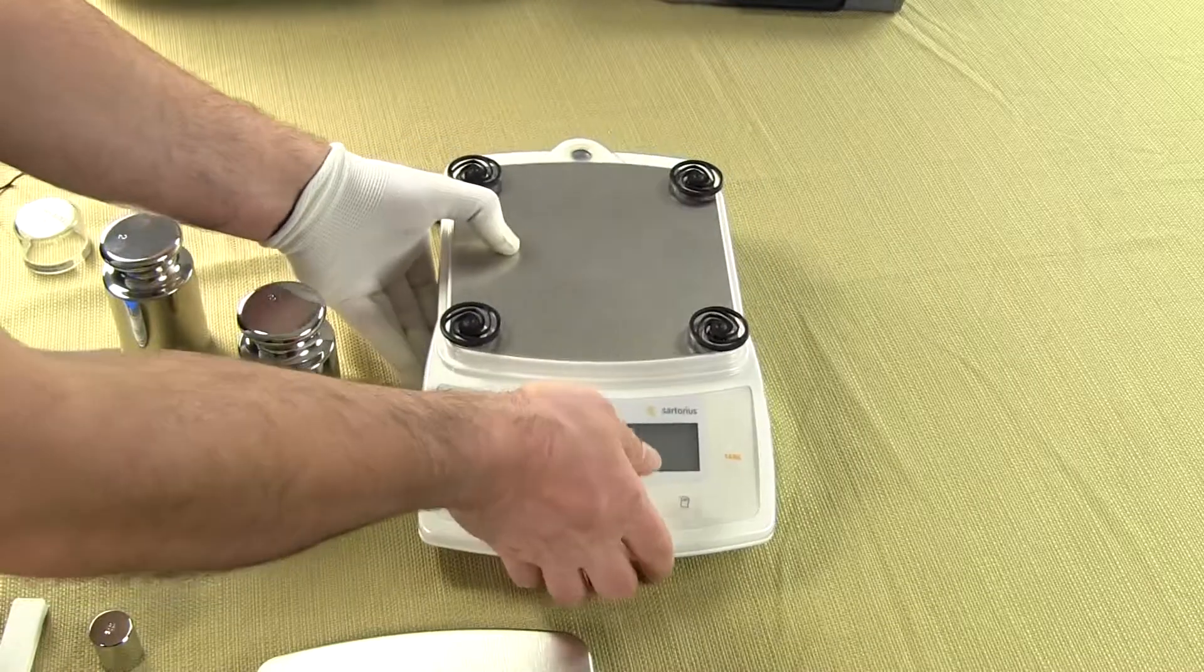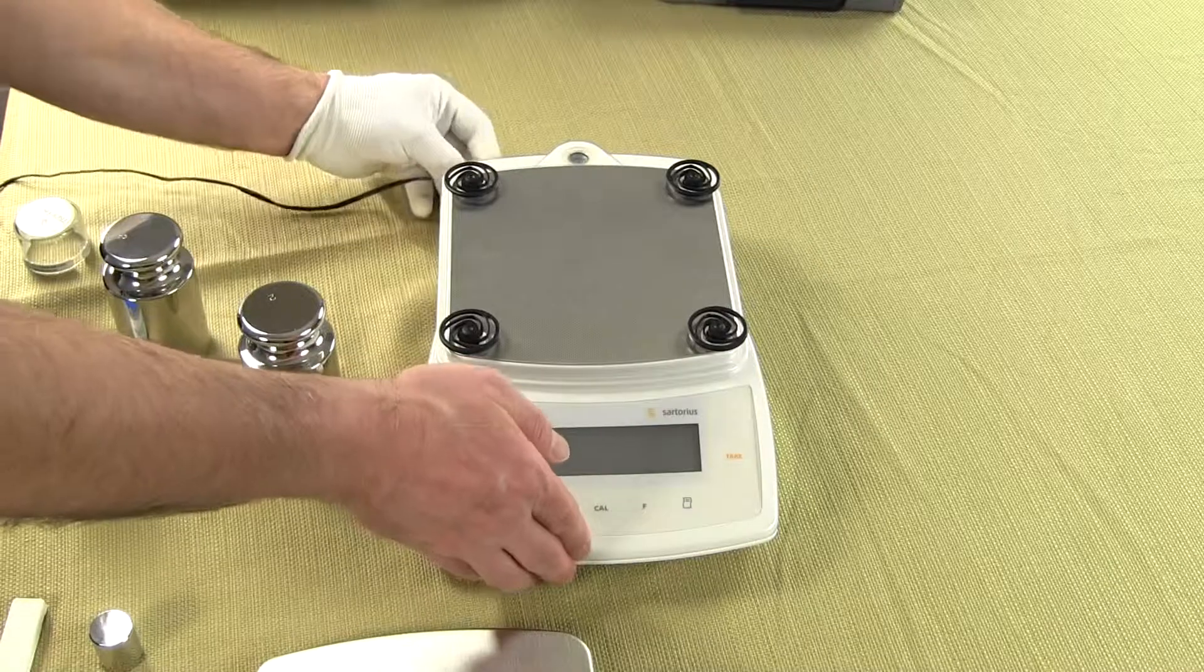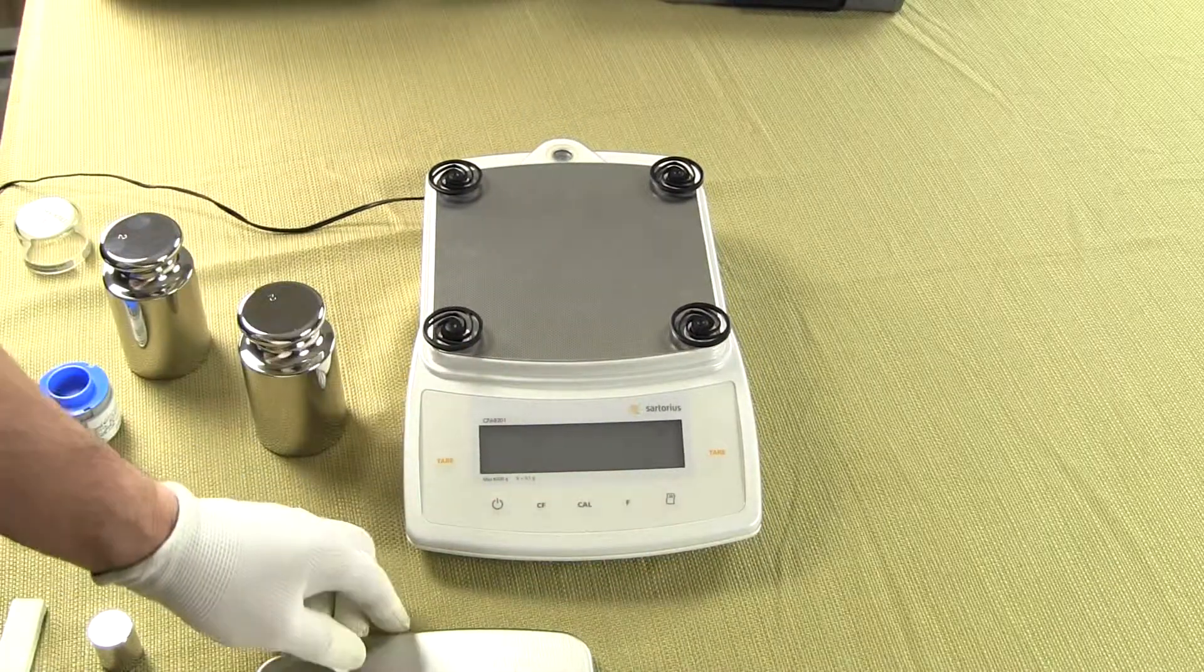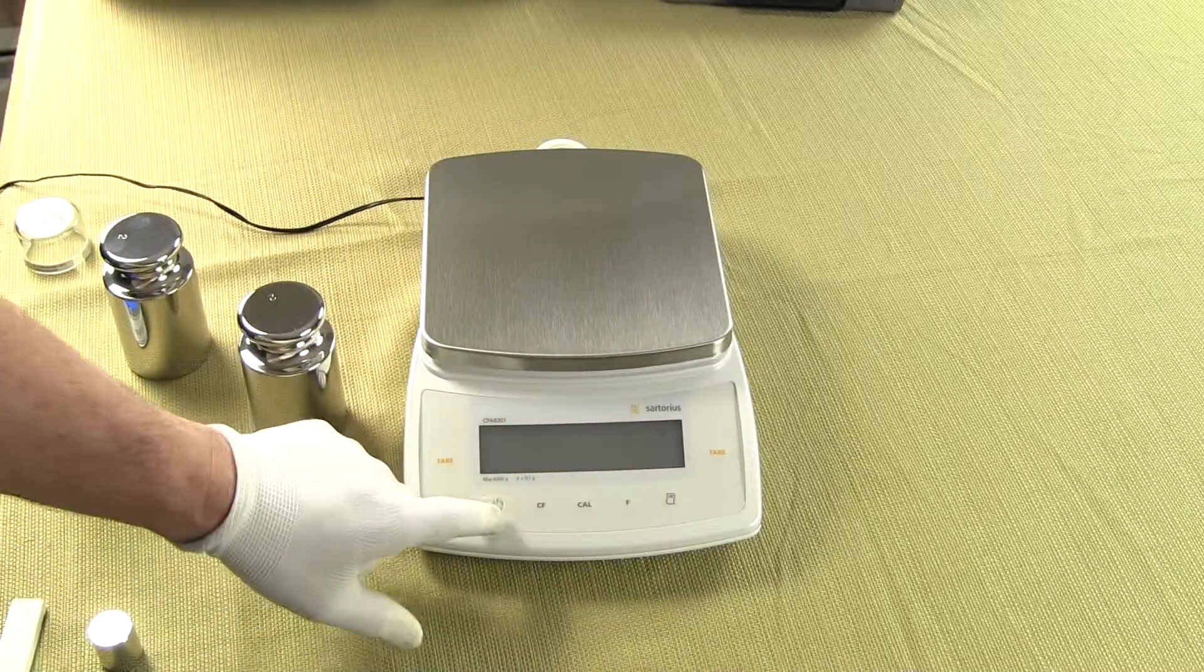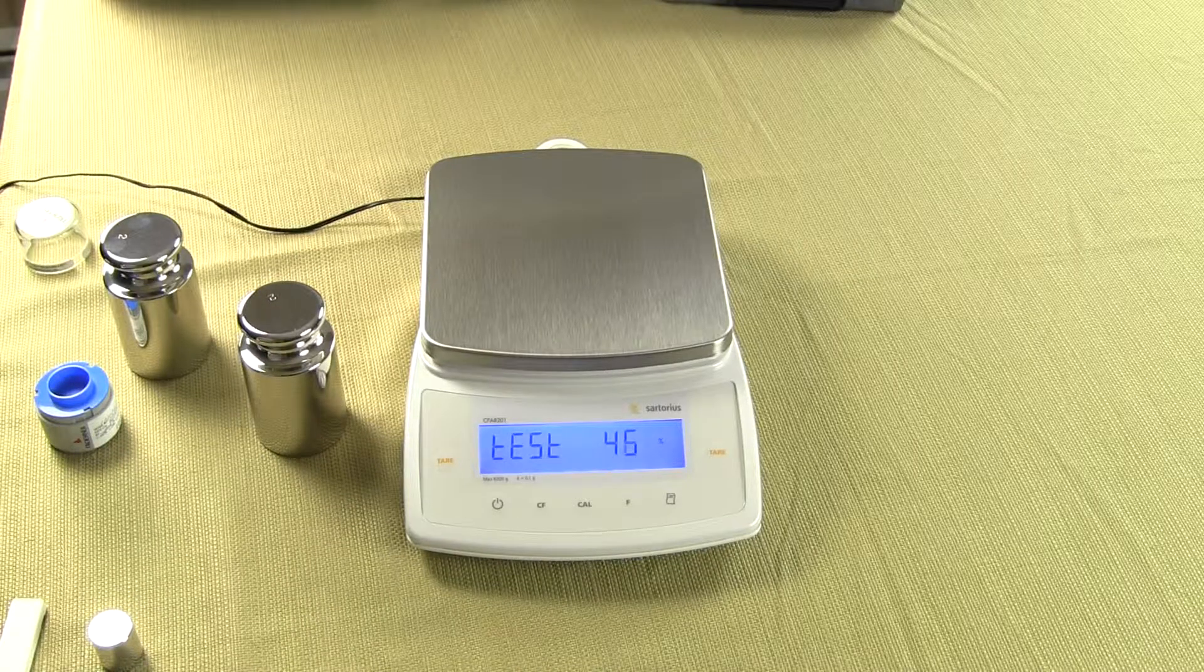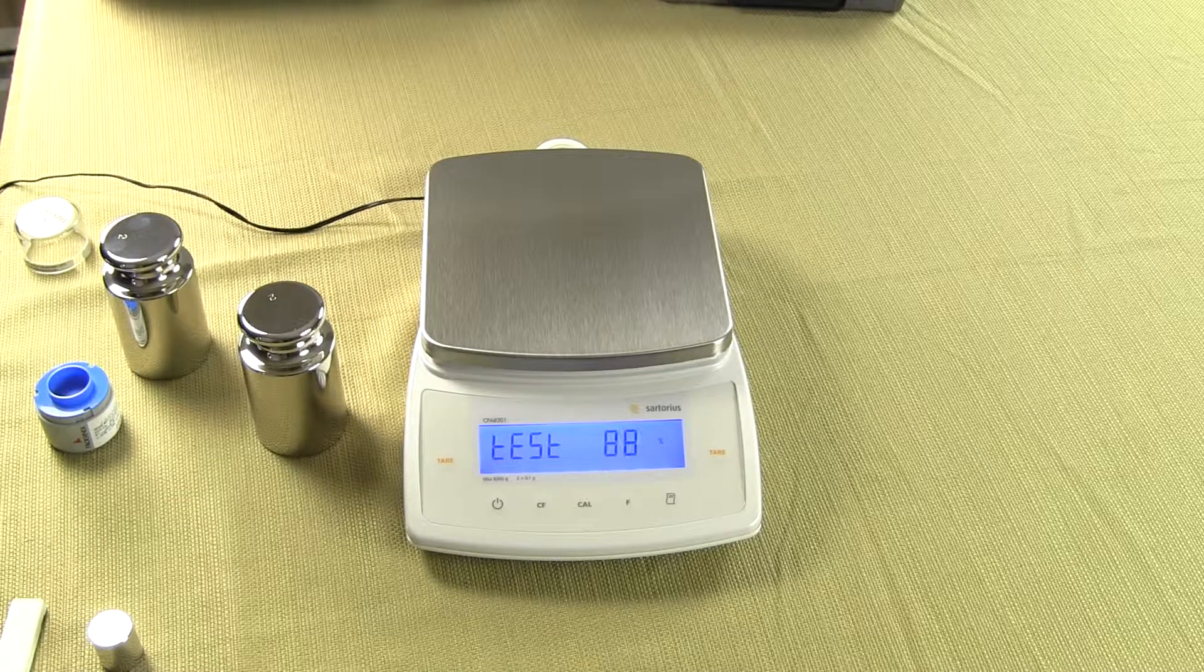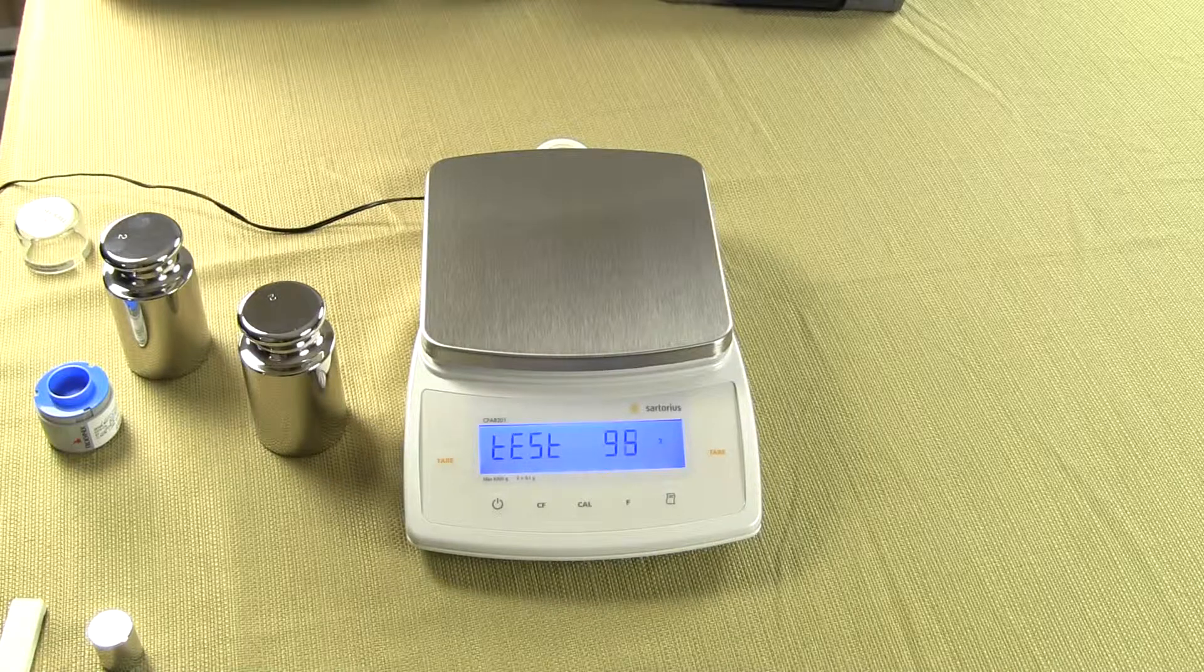So the balance is extremely simple and the CPA series for a tenth of a gram, this is the 8201. Sartorius also has another one called the CPA 5201 which is 5200 grams by a tenth of a gram, and then there's the CPA 10,000 grams by a tenth of a gram.